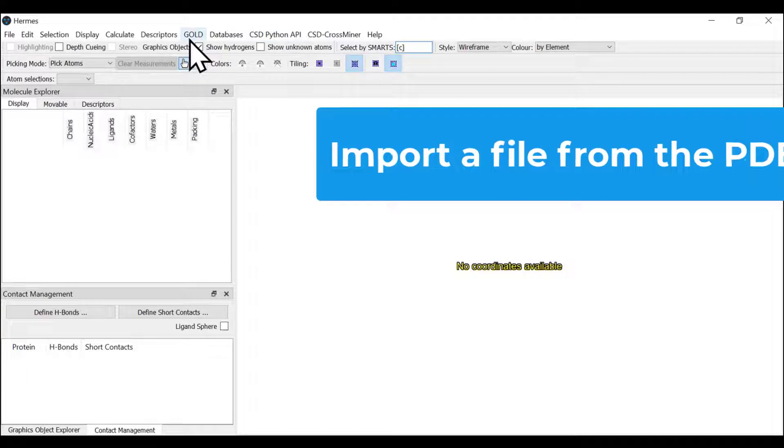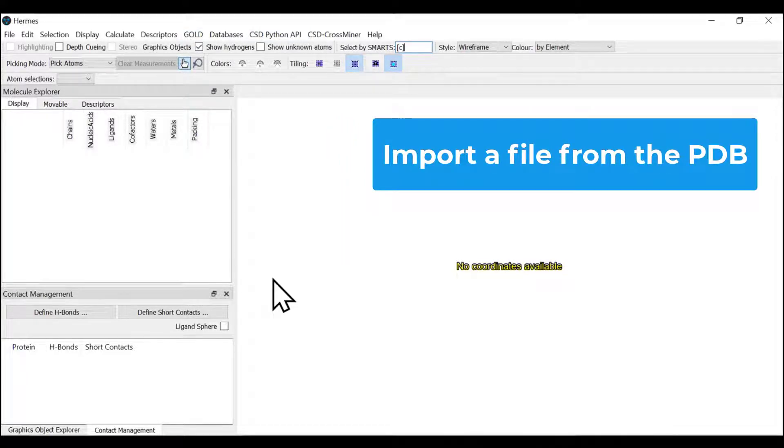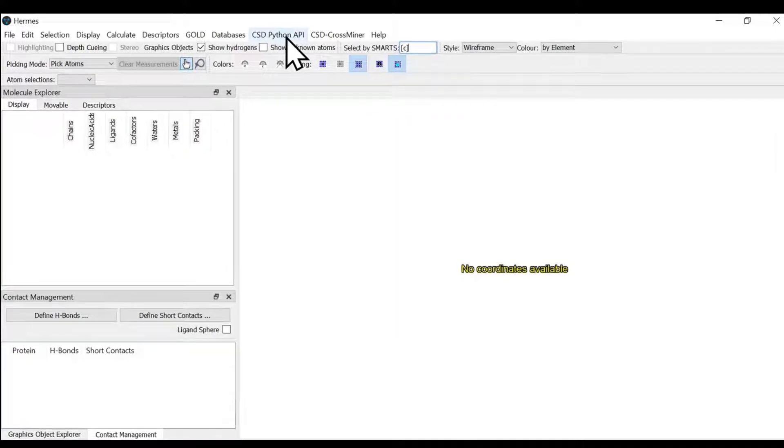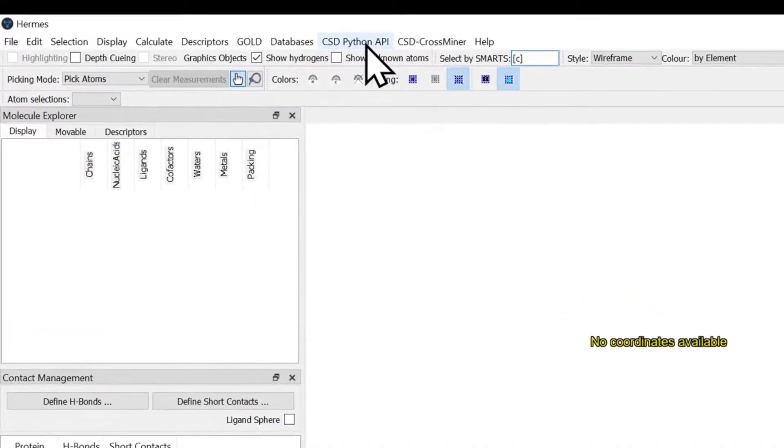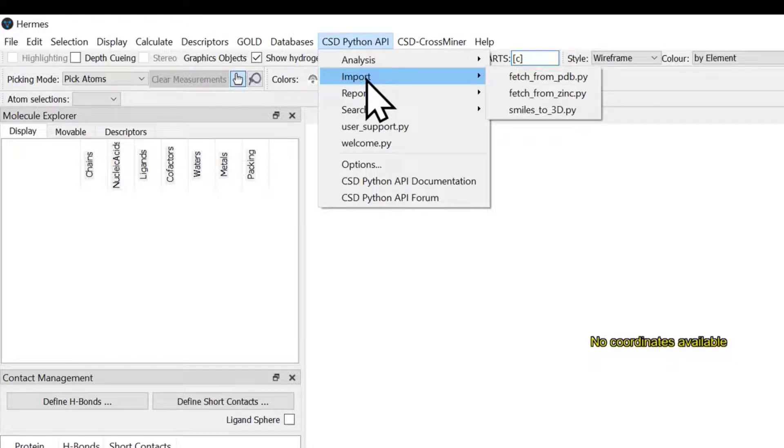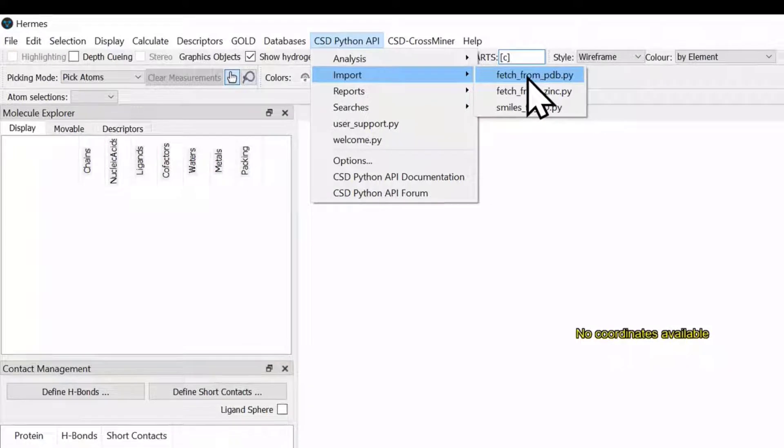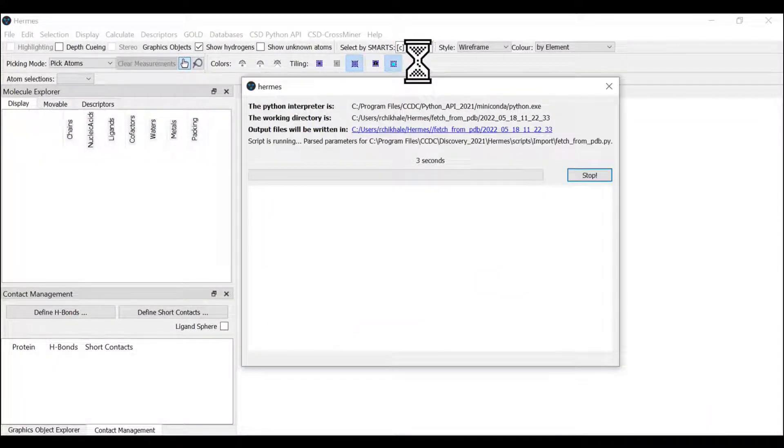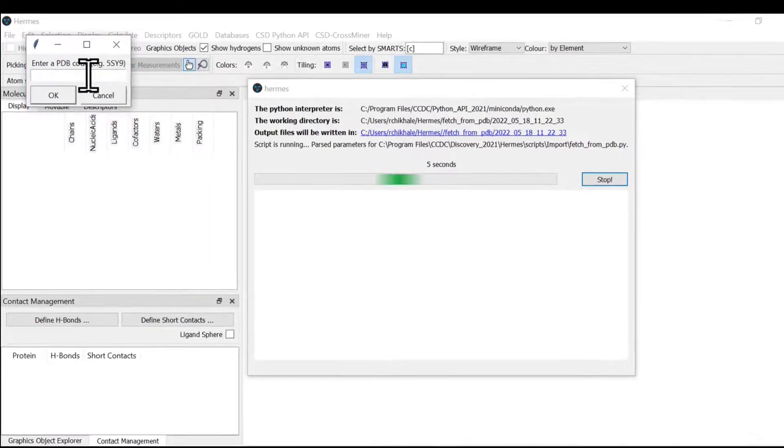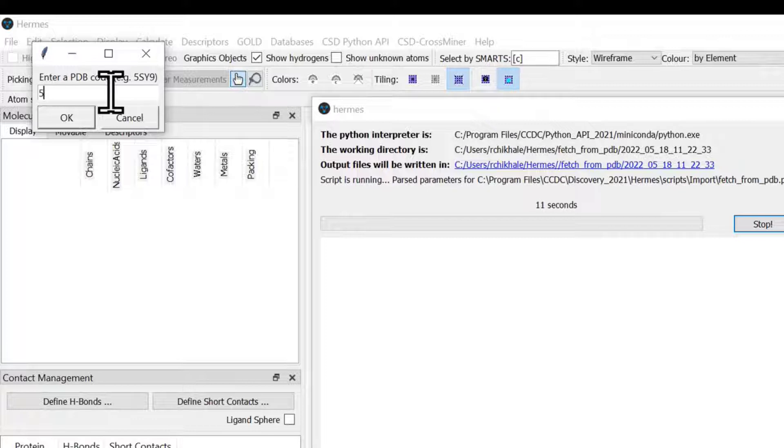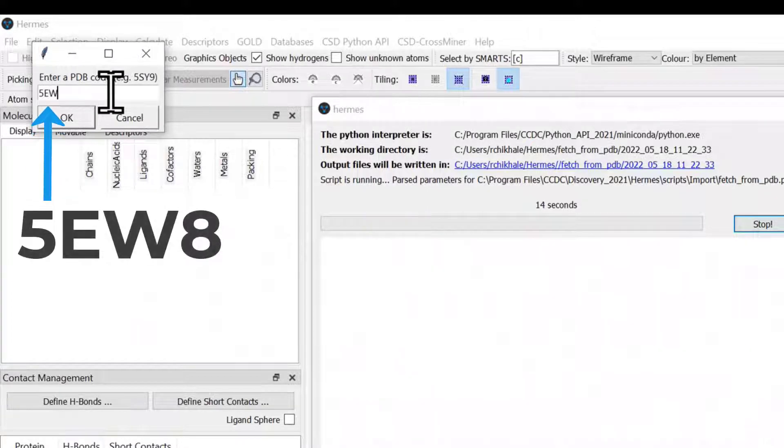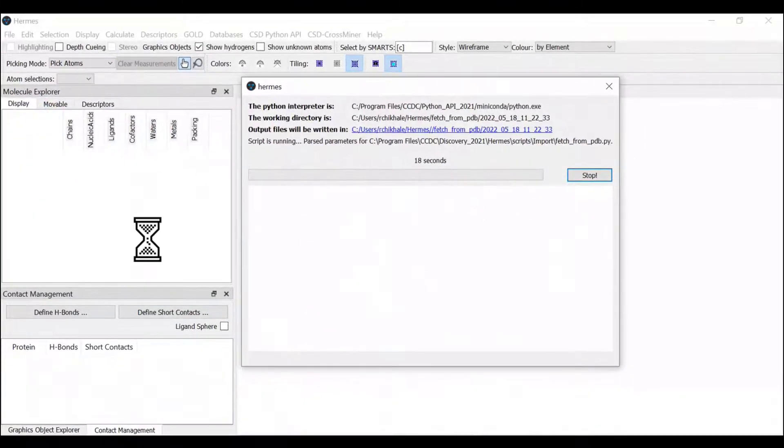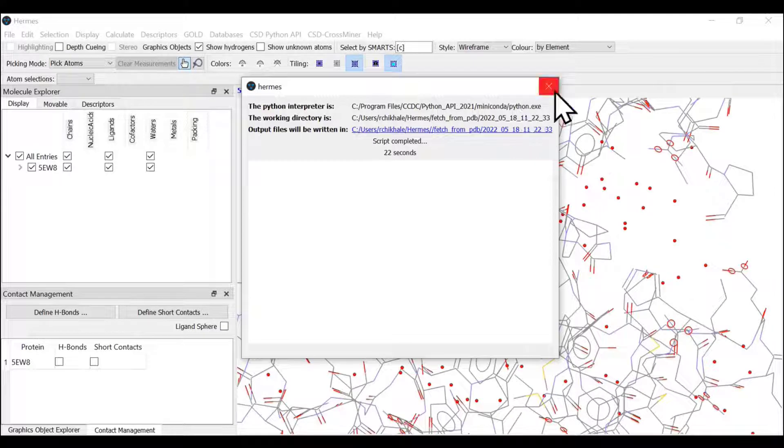Let us begin with how to import our co-crystallized ligand from the PDB. You click on CSD Python API, import, then fetch from PDB. The script asks for a PDB code. Today's PDB code is 5ew8. We're asking the Python API to import, and here we go.